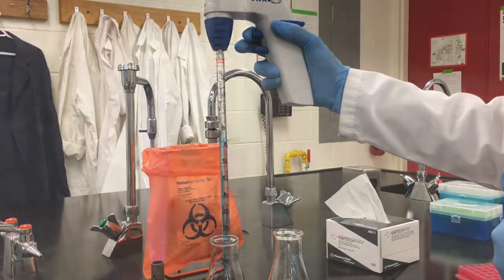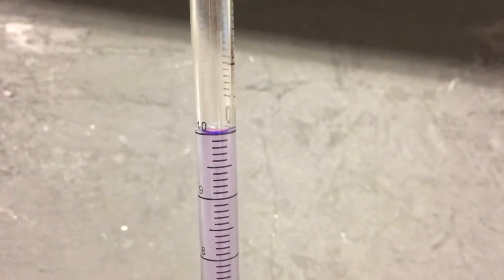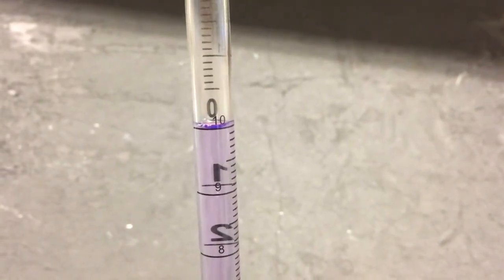Notice serological pipetter tips have both decreasing volume and increasing volume indications. When drawing up a liquid we can easily measure up to the 10 mil mark and then measure the volume dispelled by the decreasing values.